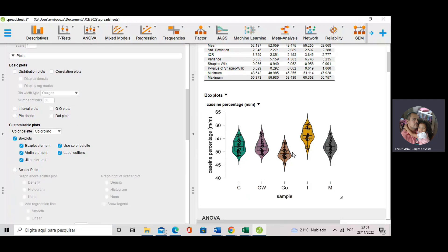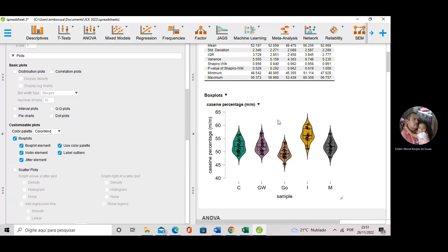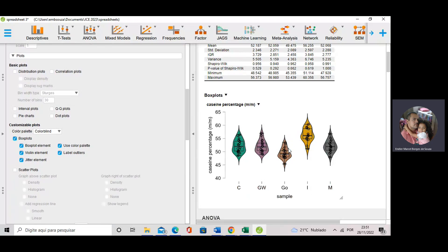We can see that whey protein sample G has lower protein content than whey protein sample E. We can do some observations. We have five whey protein samples, and I'd like to analyze and compare the protein content in these five samples.